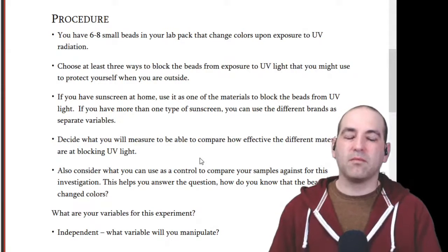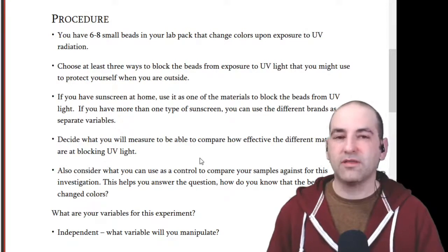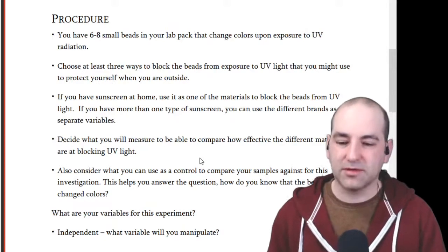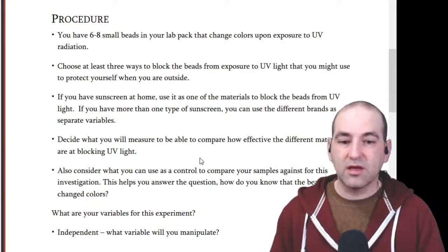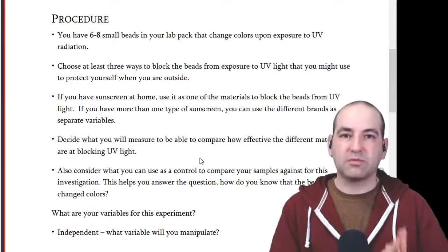So as you're developing your experiment, you can look at what's happening and then decide, you know what, that was too hard to tell. I couldn't figure out what was going on there. So I'm going to do it again. I'm going to do it a little bit differently. Right. But the idea is by the end, you can really say this thing blocked it better than this, and this blocked better than this, and this blocked better than this.